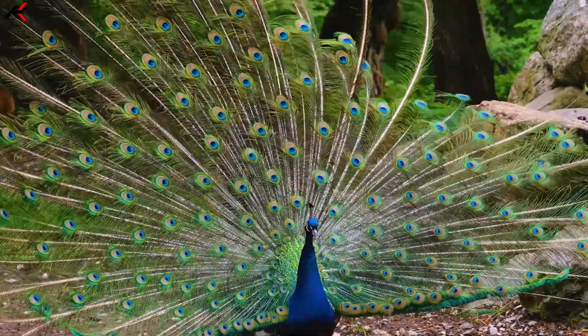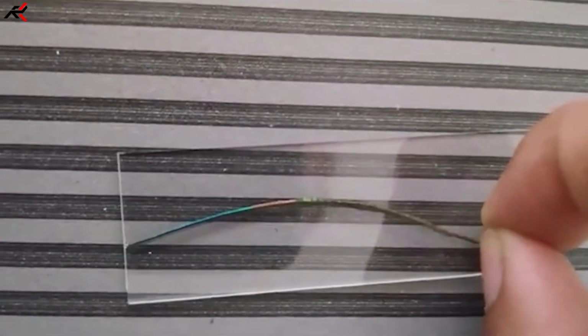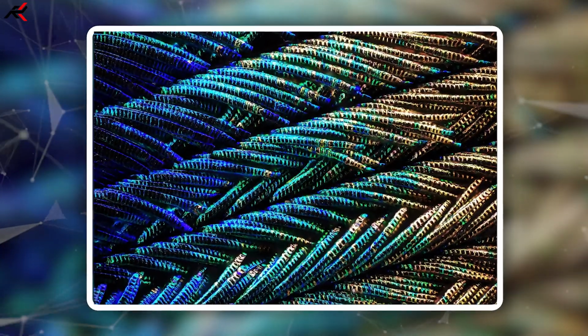Guys, peacock feather looks very beautiful in appearance, which you will also like. When you look at that under the microscope, the first time you will see like a thread, and after more zoom you will see many color patterns and inner knitting, which is visible so beautiful.